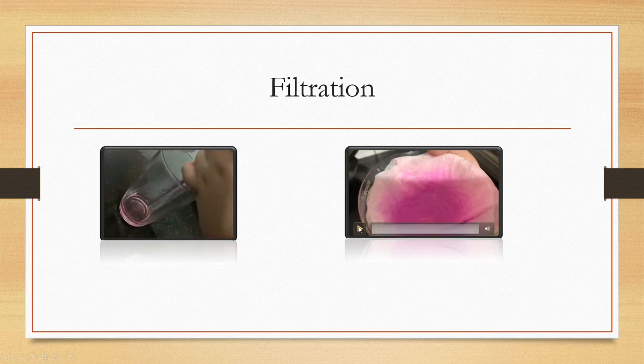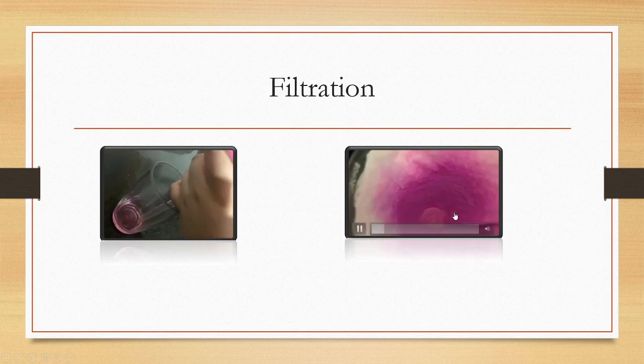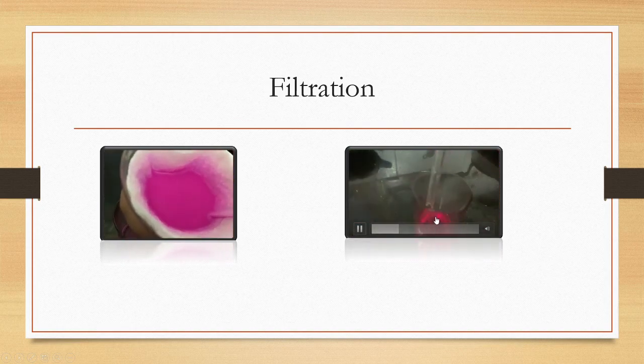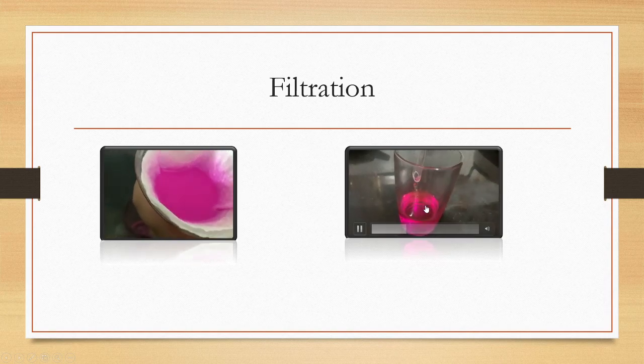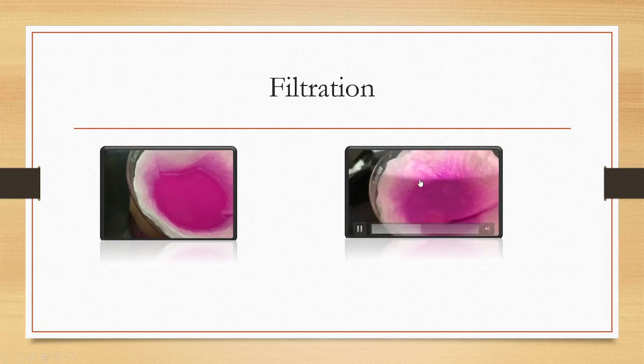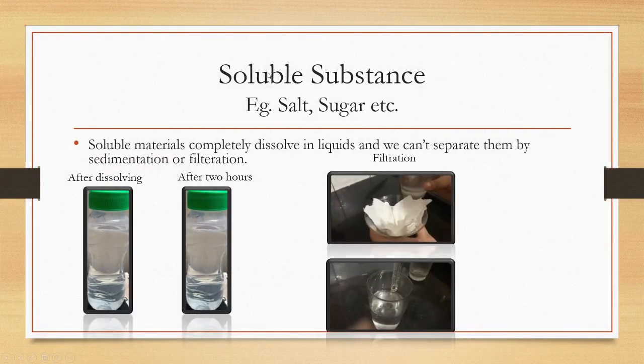It takes a lot of time. After it was done, you can see that the residue, the dirty particles, is here, and the filtrate is down, but this water is still not drinkable. We cannot drink this water. Soluble substances completely dissolve in water or in liquids, and we can't separate them by sedimentation or filtration.